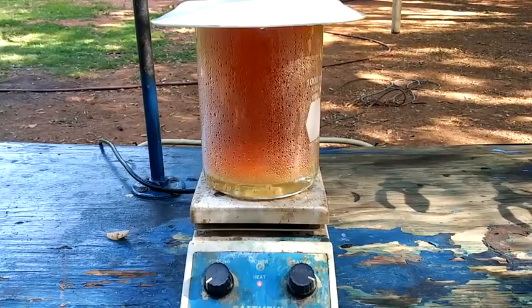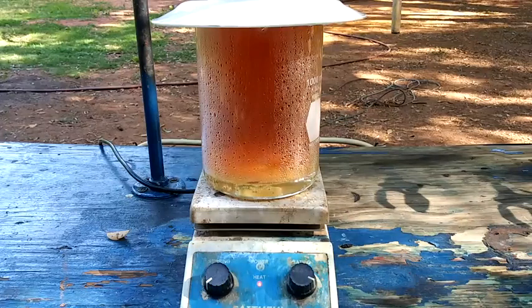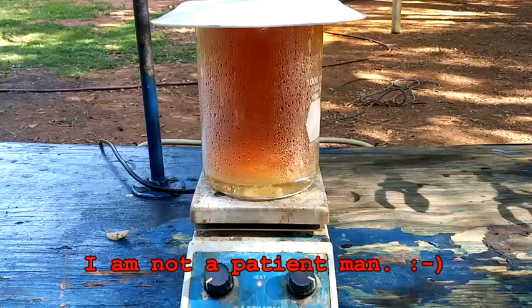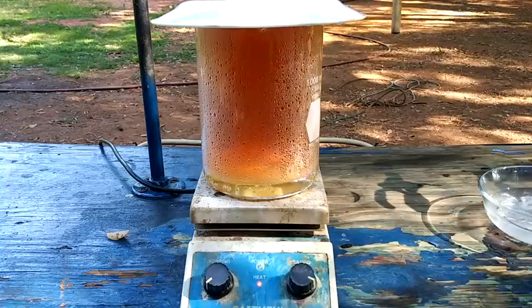Alright, so as you can see, the color has become a bit more pale. The amount of gas being produced is a lot lower than it was. The heat is on full, and the reaction is going, but it's starting to slow down some. So I'm going to go ahead and add some more nitric acid. Oops, top off of the first here.